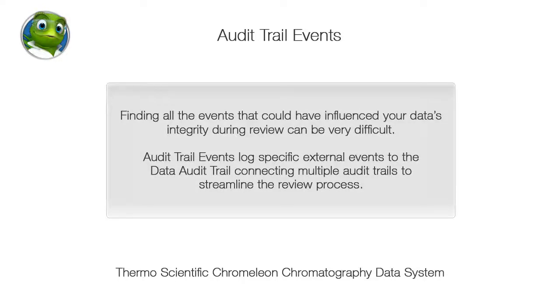Finding all the events that could have influenced your data's integrity during review can be very difficult. Audit trail events log specific external events to the data audit trail, connecting multiple audit trails to streamline the review process.